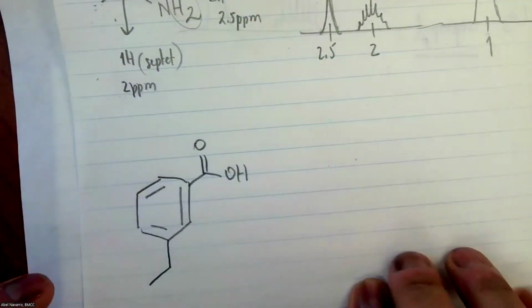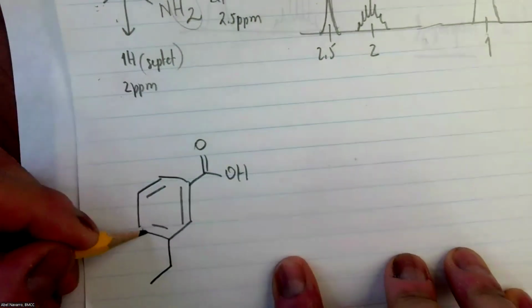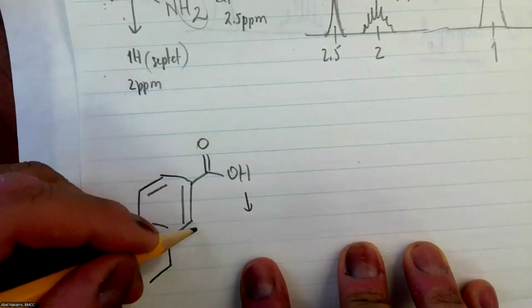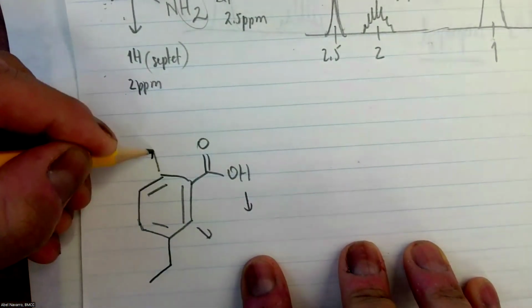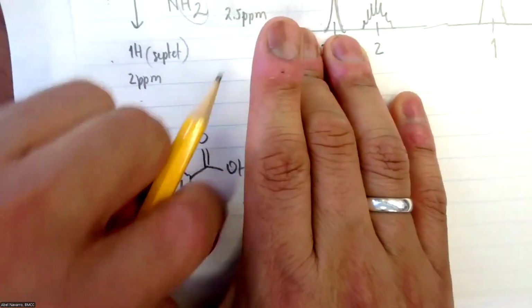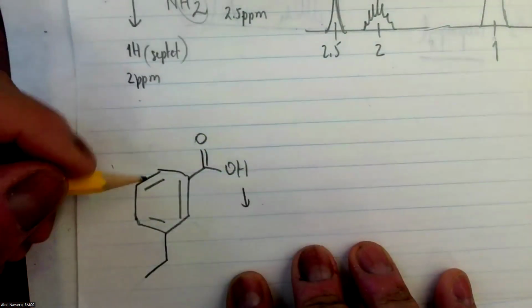Actually, I will do one more after this. Okay, so here, how many peaks? Well, first determine the number of peaks. Okay, 1, 2, there is no symmetry here. All the aromatics can be encapsulated in one single peak.